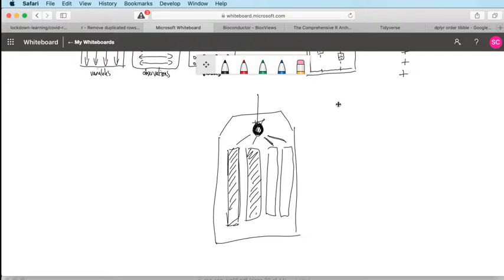So what you have to do to load your flow cell is to make a mixture of all of your sequencing libraries. You prepare all of your sequencing libraries, and then at some point during the library prep, they get mixed together and then loaded onto the flow cell all together, all in one go. And so then you generate your reads. From a high output NextSeq flow cell, I think you get about 400 million clusters, so about 400 million single end reads.